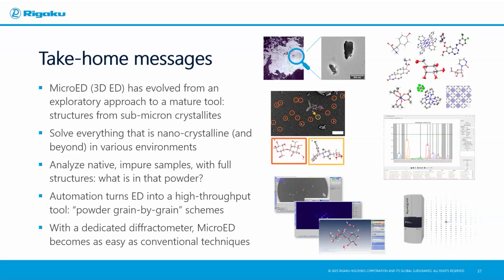Thank you for your talk. When you're reporting quantitative data based off of sizes, percentage of a compound contained, is that based off of how many diffraction spots you're taking, or does the size of the grain matter?